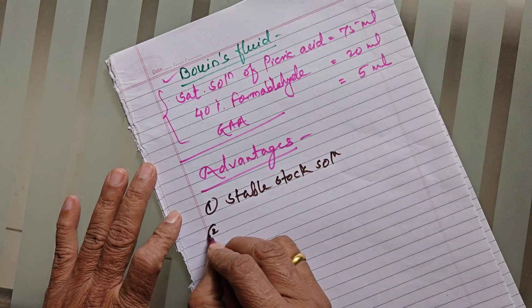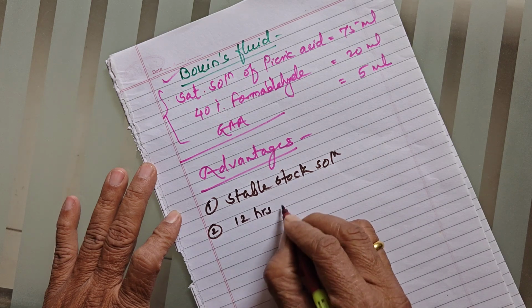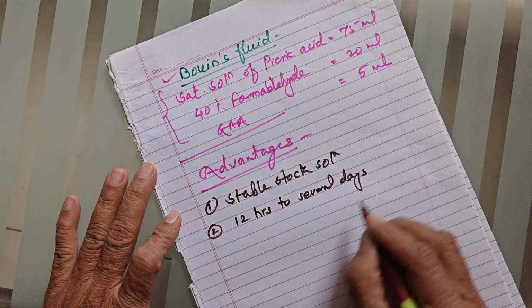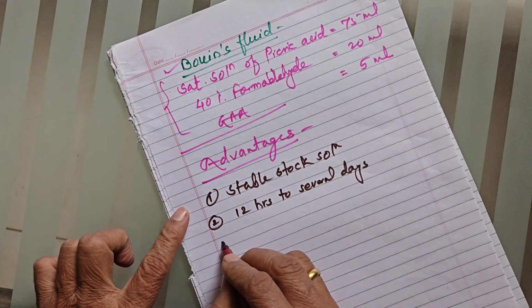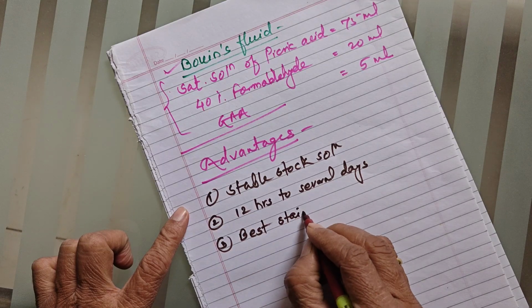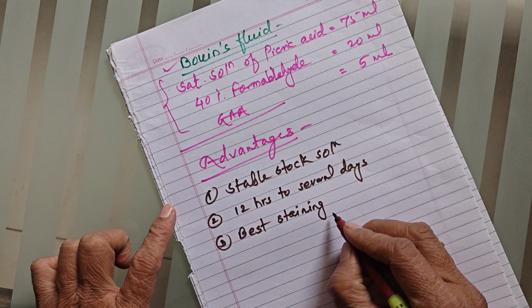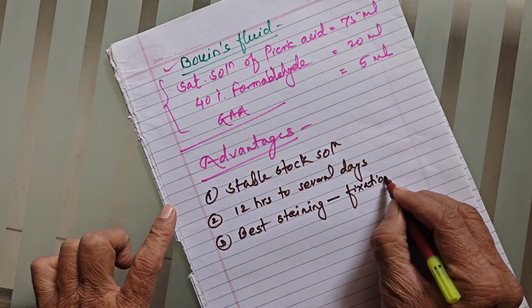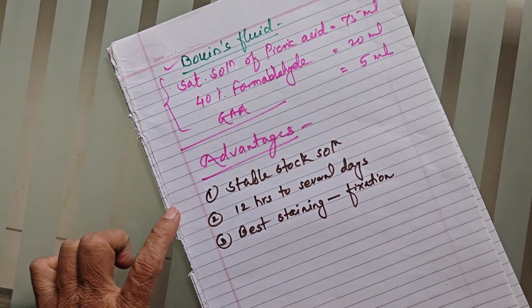The second advantage is the fixation time is recommended for 12 hours to several days. But the best staining results are achieved if the material is processed as soon as possible after fixation. That is, if the fixation time is over, then immediately you should transfer to the next grade.